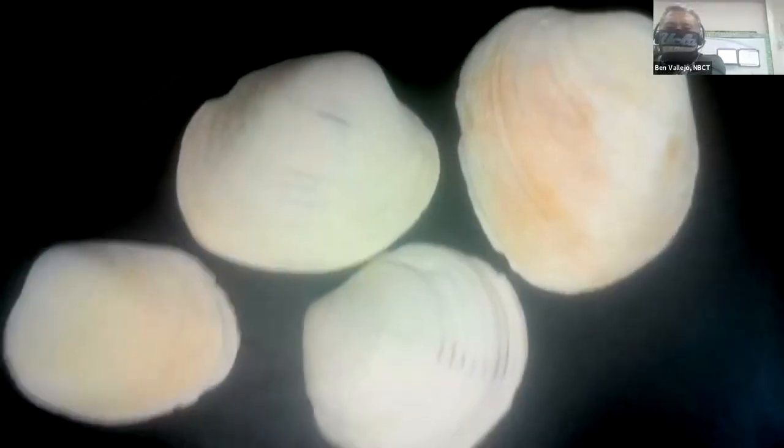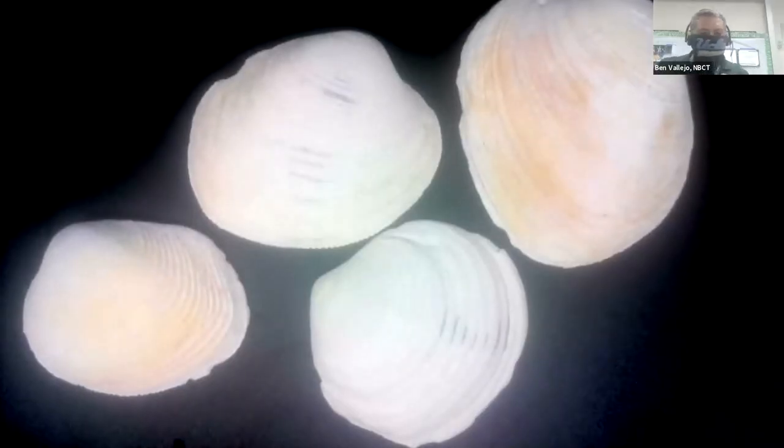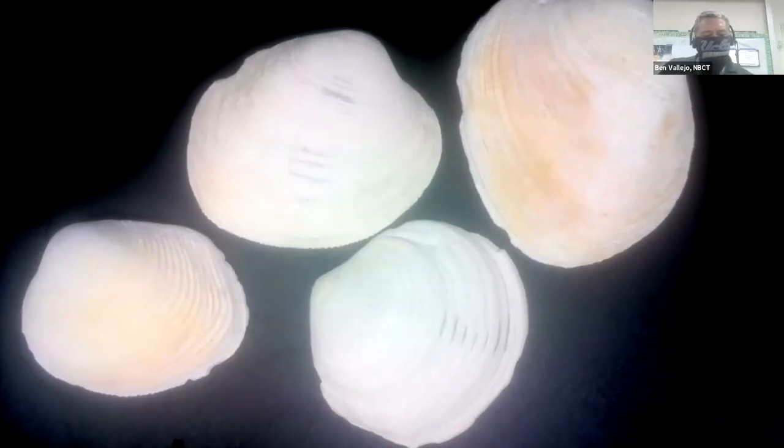We need to be able to see those bands, because what it is, you guys, is it's like the rings on a tree, right? So what we're going to do is we're going to count those, and then we're going to figure out the average bandwidth, the number of bands, and then the age of the shell.